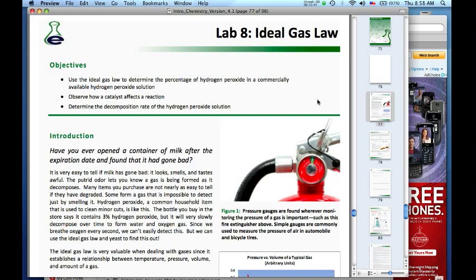And with hydrogen peroxide, don't let it mix with metals. Don't store hydrogen peroxide in metal containers. You can create explosives. Not like explosives that are used to blow up a building, just really shock-sensitive explosives that might blow up in your hand, for instance, if you move the bowl. So it's not a very good thing to do to store hydrogen peroxide in metal containers.